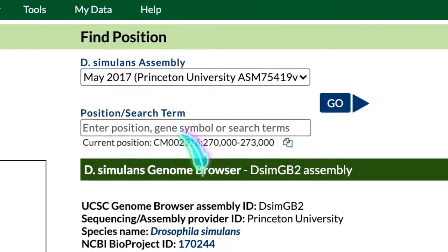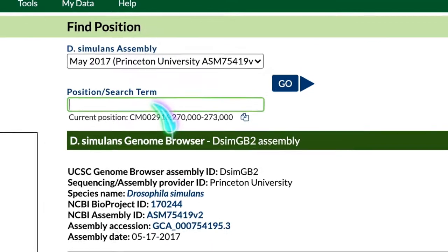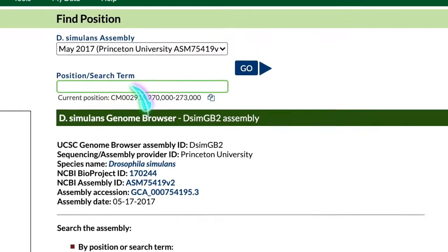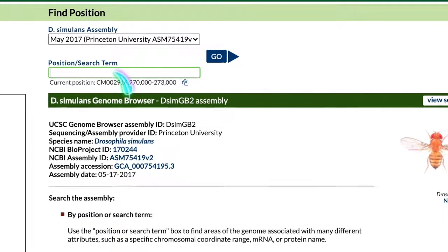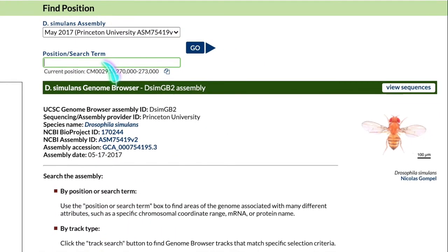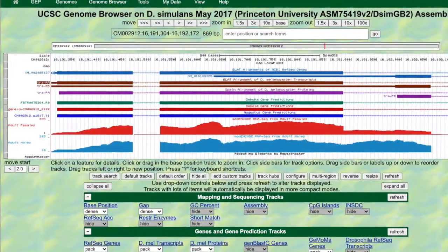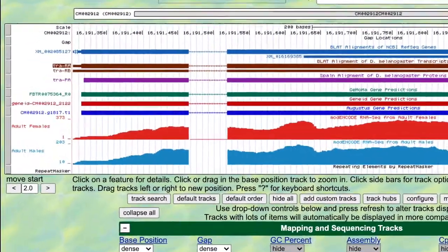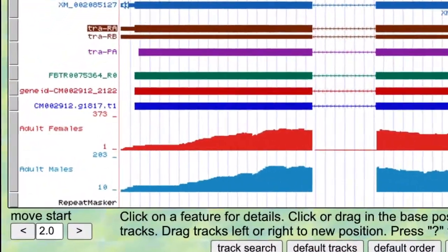For the search term, you can input a gene symbol, protein name, coordinates, accession numbers, and so on. I'm going to put in tra, which is the gene symbol for the transformer gene, and you can also include the isoform for more precision and potentially even faster results.